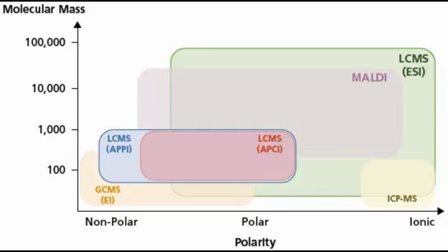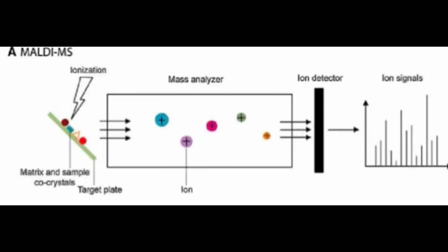This opened up pharmaceutical analysis, metabolomics, proteomics, and countless other fields. Now let's talk about matrix assisted laser desorption ionization. This technique was introduced in the mid 1980s and represents another approach to soft ionization. In MALDI, your sample is mixed with a matrix compound and deposited on a target plate.